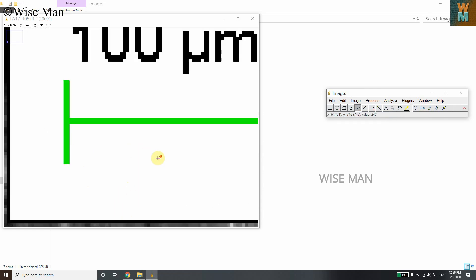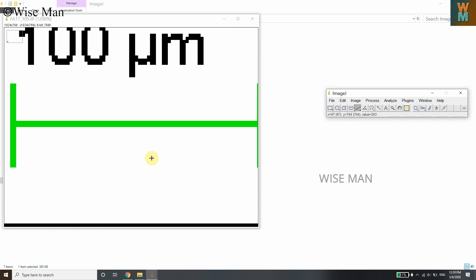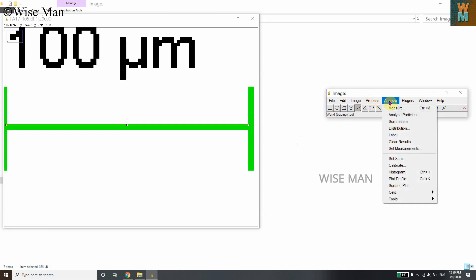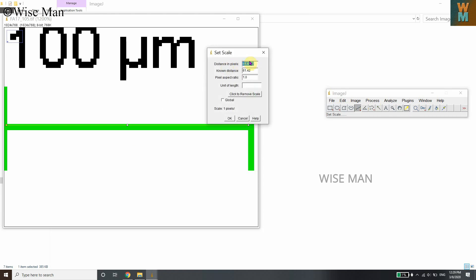The more you zoom in, the more precise your measurement will be. To measure the scale bar length, hold the Shift key and drag the mouse to draw a straight line along the scale bar. This is the 100 micrometer reference length. Now go to Analyze and click Set Scale. You can see the distance in pixels — it shows 81.4167 pixels.